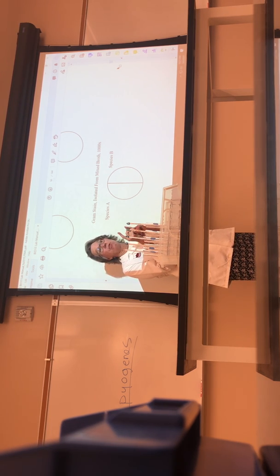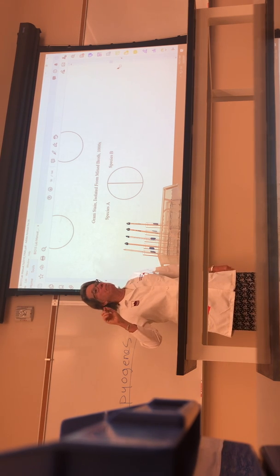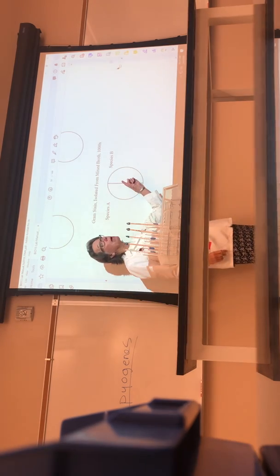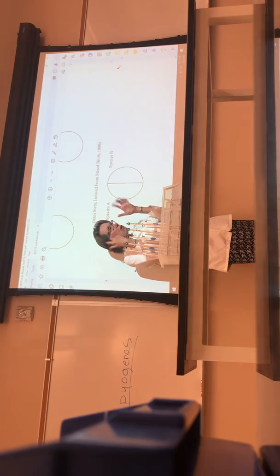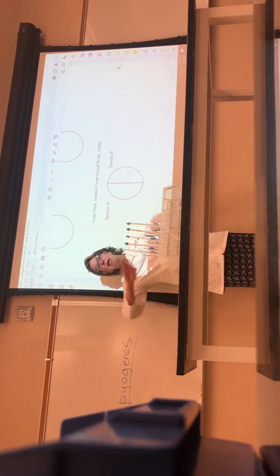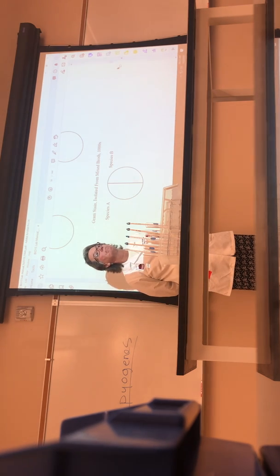A few of you also had some growth on a salt plate. You should have labeled that slant with your unknown number and that it came from a salt plate. Now you know that's your species that was the gram positive. So what we're trying to do here in all this is separate your gram positive and your gram negative, and get them growing on slants.